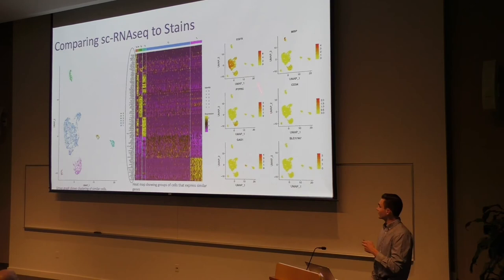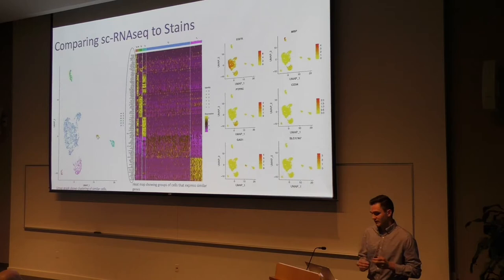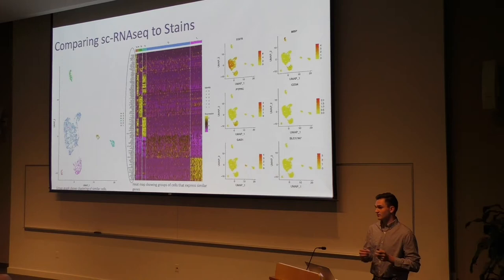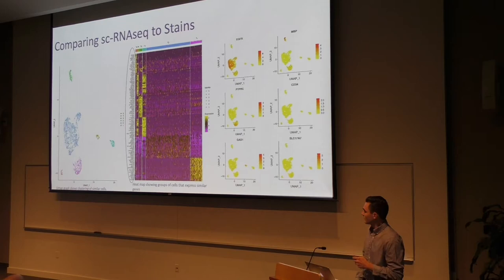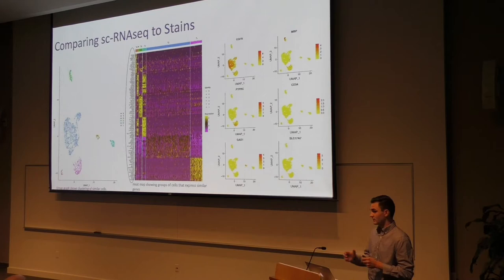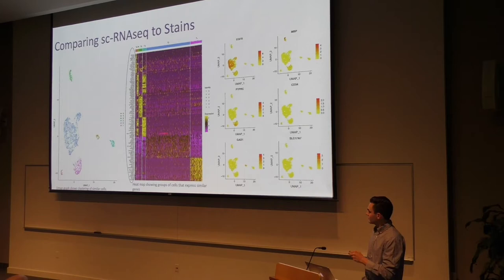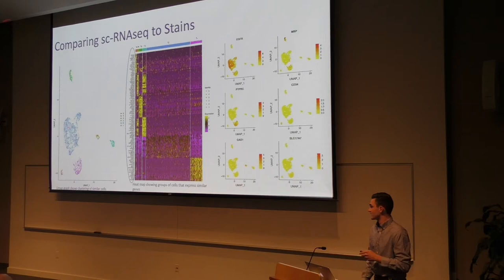The last portion of the project — we didn't get to finish it. We really wanted to compare using single-cell RNA sequencing, where you take a piece of tissue, break it down into single cells, and sequence the RNA within those single cells. We wanted to compare the single-cell RNA-seq of the tumor itself to the organoid-derived tumor to see if we were getting the same gene expression. But we only got to the tumor — we never got to the organoid. What you're seeing on the left is a UMAP, which clusters cells based on principal components — the co-expression of genes normally expressed together. These clusters represent single cells expressing the same types of genes.